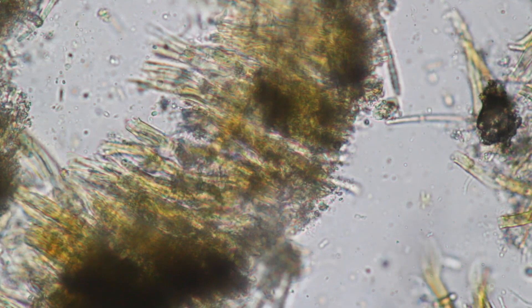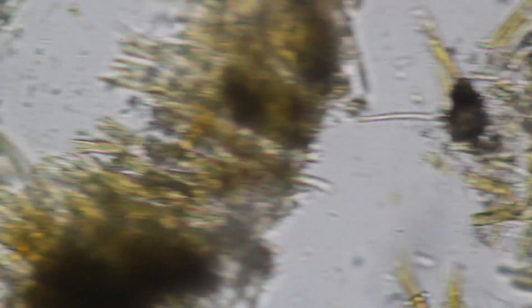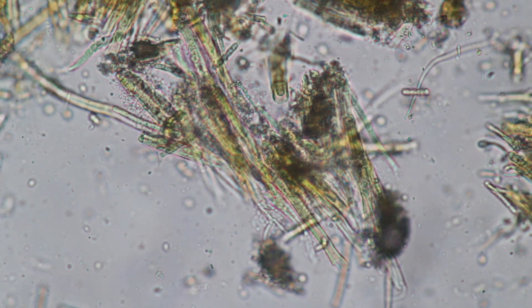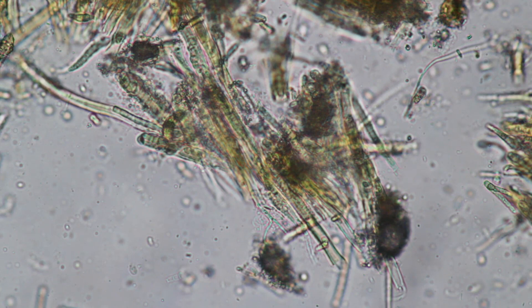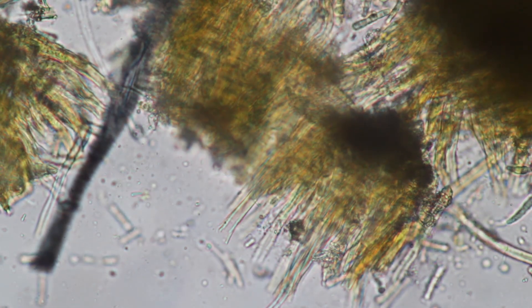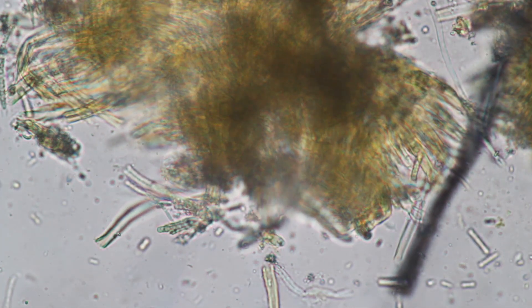Now, what did I see? Of course, a lot of organic material and cells — in this case, these seem to be some kind of algae from the biofilm. There is a problem: when you scratch material away from a surface you inevitably end up damaging a lot of cells, especially if the biofilm is firmly attached. Scratching destroys many cells, so the original structure is not really preserved. But we can see a greenish-brownish coloration from the chlorophyll, and occasionally interspersed between the algae there are also some diatoms.